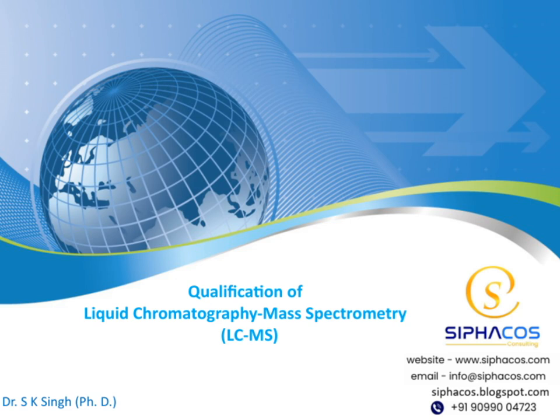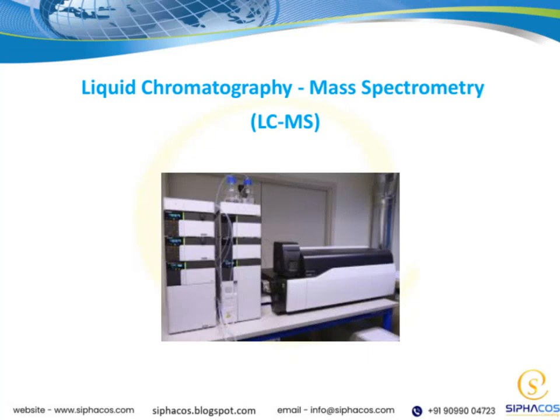Let's get started. Today, I want to introduce you to liquid chromatography mass spectrometry, or LCMS for short. This technique is a powerful combination of two methods that work together to analyze complex mixtures. First, liquid chromatography separates the components of a mixture based on their interactions with the stationary and mobile phases. Think of it as a way to sort out the different molecules so we can study them individually. Then, mass spectrometry comes into play by analyzing the separated molecules, providing detailed information about their mass and structure.